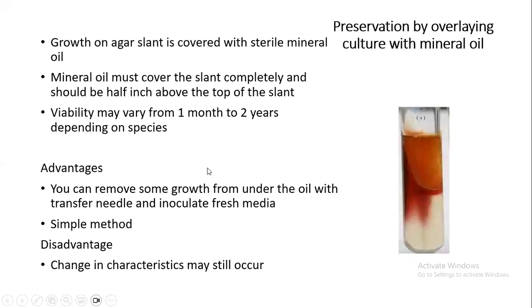So again, subculturing is required, but it may vary from species to species, and sometimes the subculturing time can be as long as 2 years. So it is slightly better than the regular weekly subculture we saw in the first method.